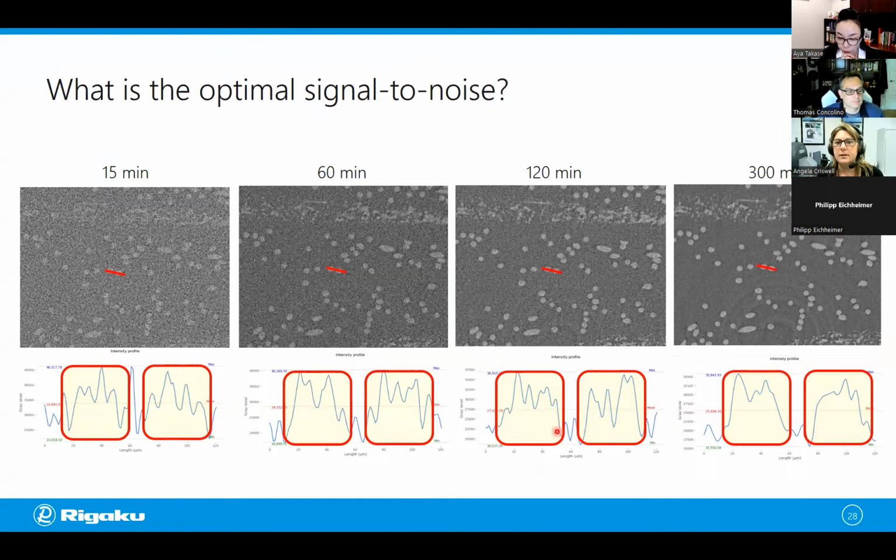You'd have to pick something lower and you'd see that you pick up some of the background pixels and mislabel them as fiber. Here, it would become even harder. And here, it's just way too noisy. So for these two lower exposure times, picking a threshold of some value is going to be difficult. And that's illustrated absolutely if you look at all the pixel intensities in that Otsu binarization. This is just looking at it at a smaller scale.